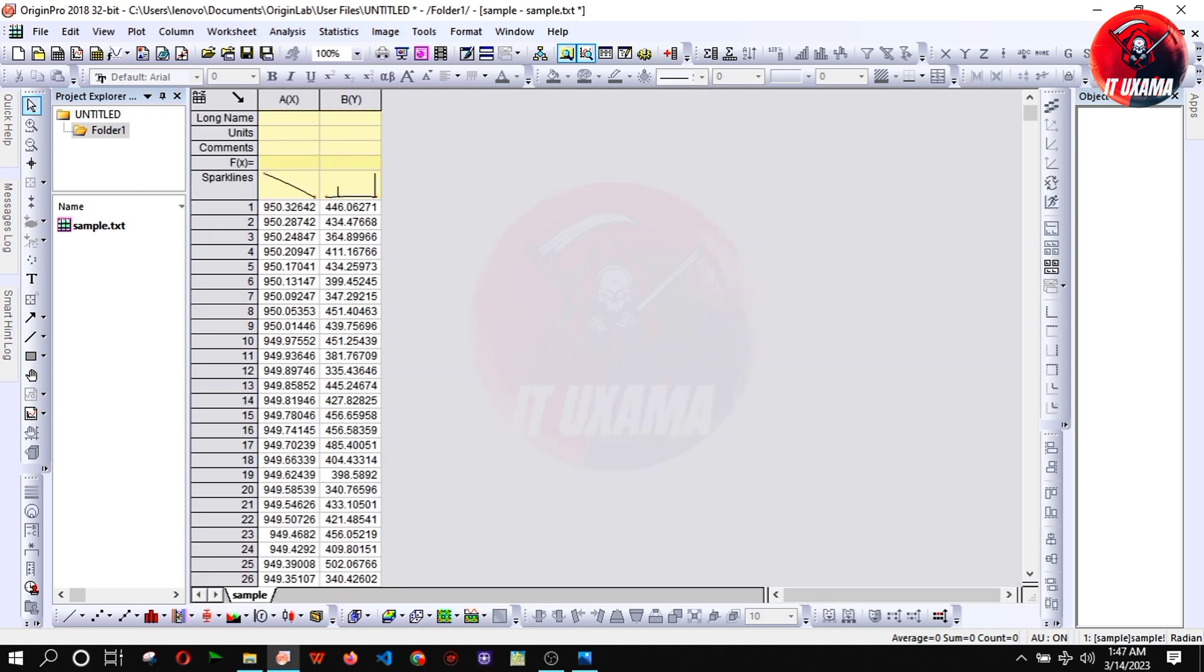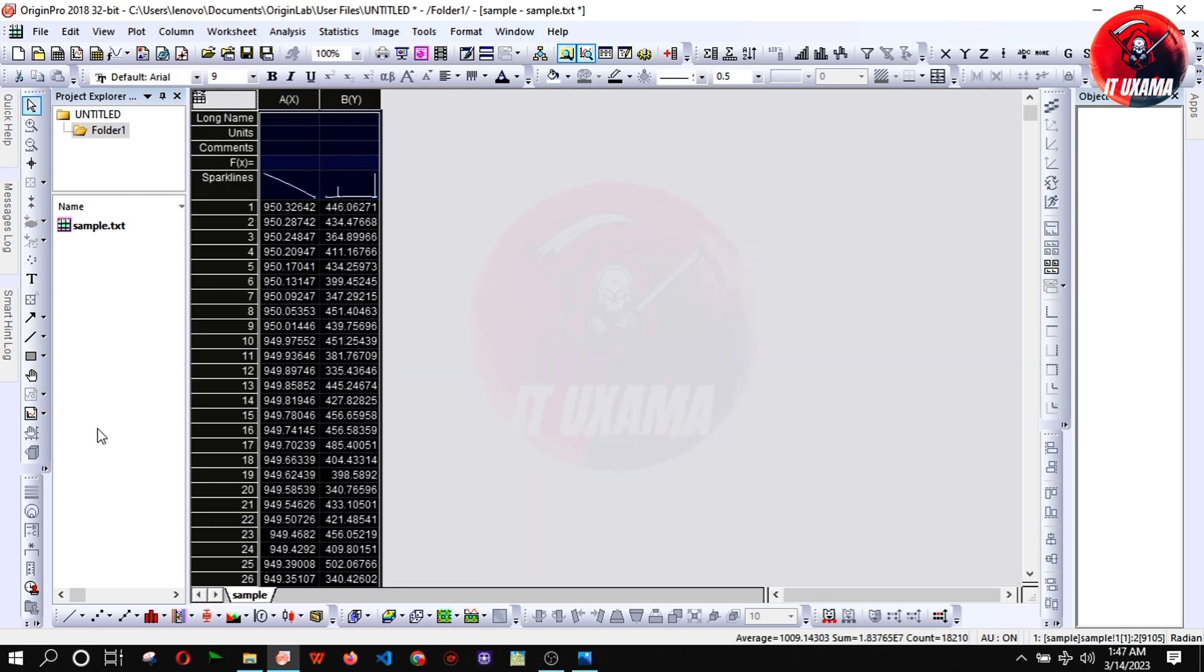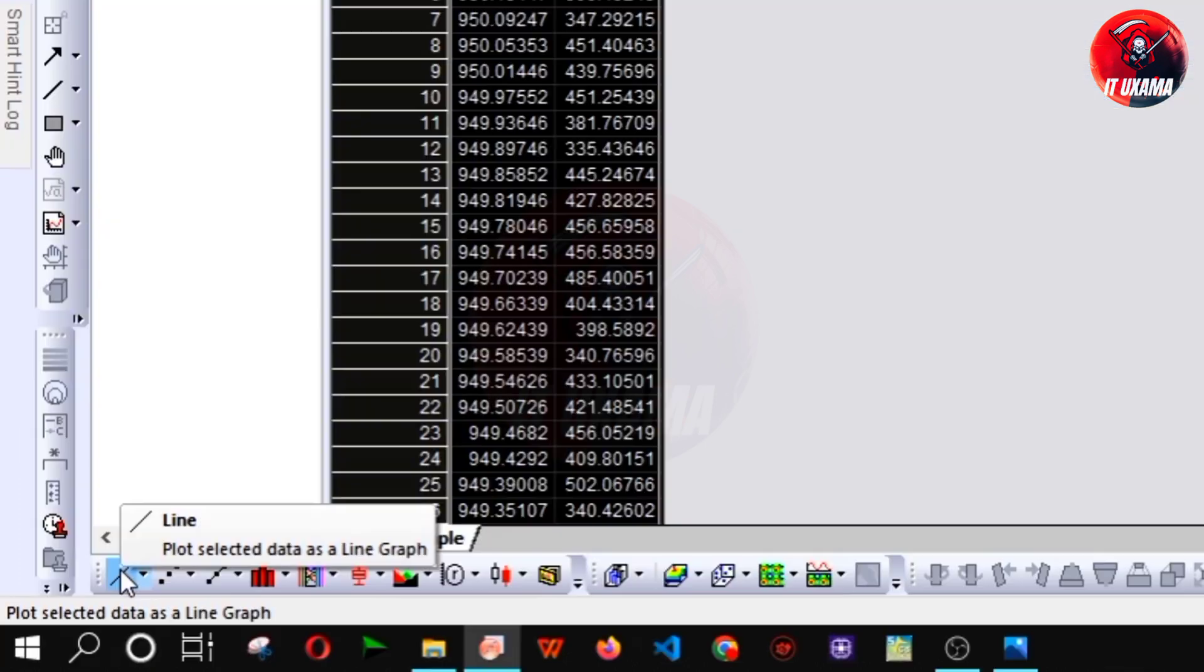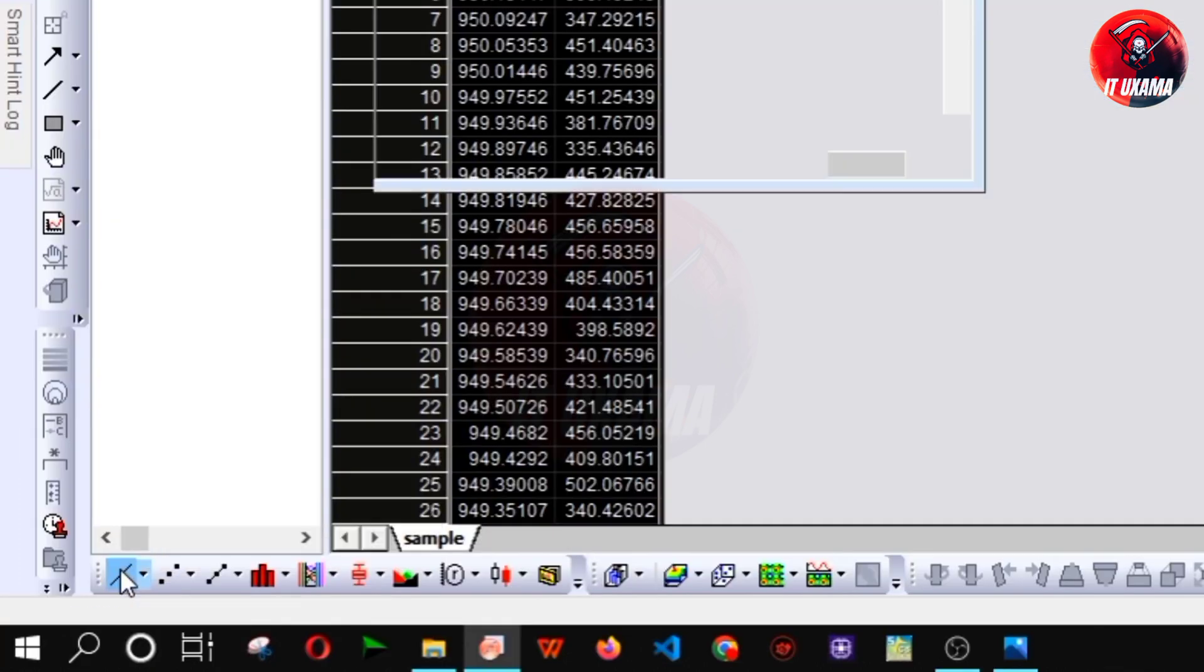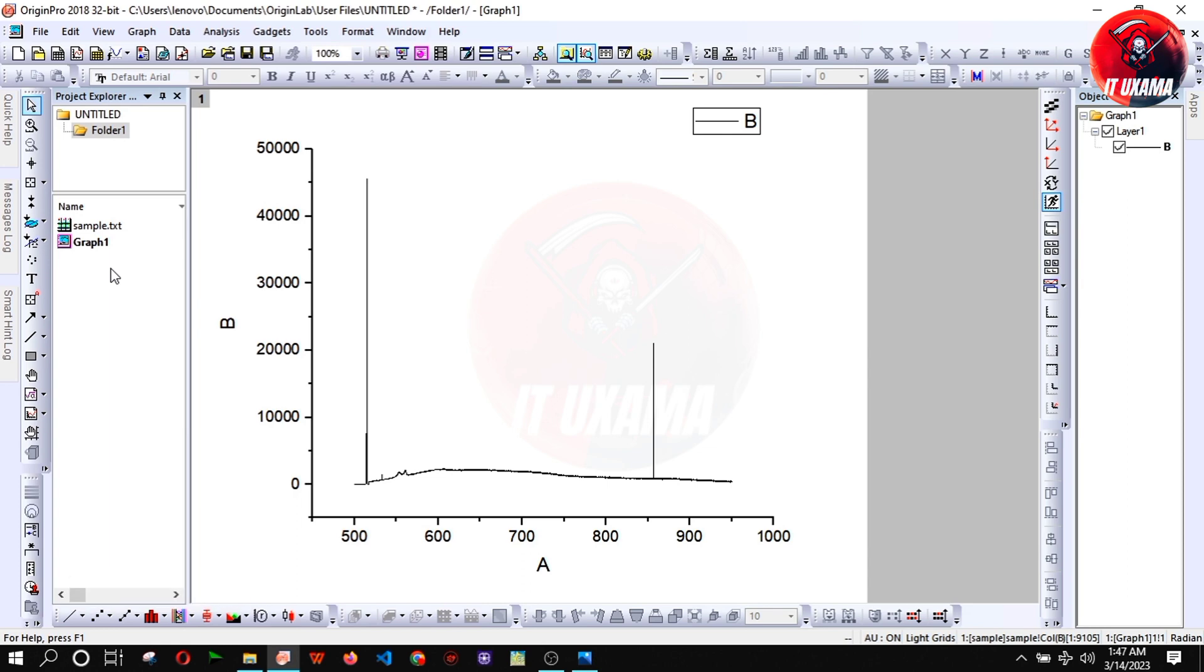Now you have to select the data. You can use Ctrl+A command or Ctrl and click on column. Then on bottom left corner click on line plot options.